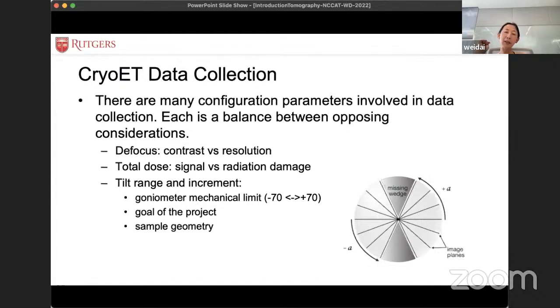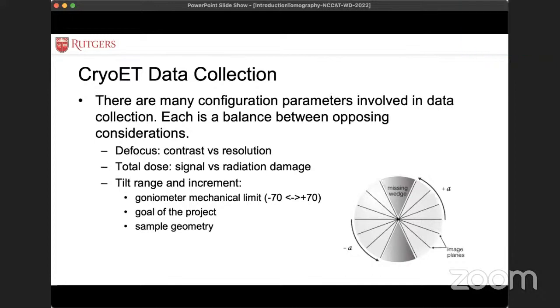But does it mean the lower number of images in the tilt series, the better? If you look at this, basically a lower number of tilt images in the tilt series means bigger gaps between two images, also meaning a bigger gap to compensate for in Fourier space. Correct. So then you look for another particle that has a different orientation and may fulfill the gap?